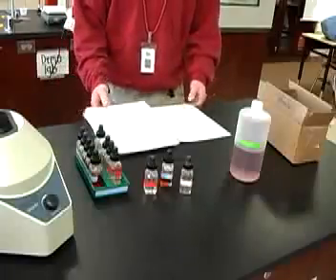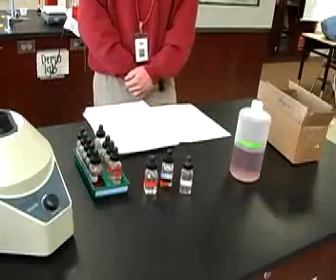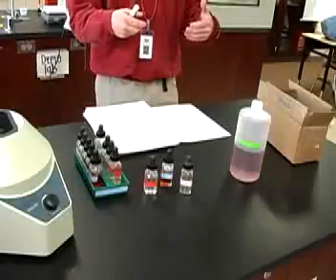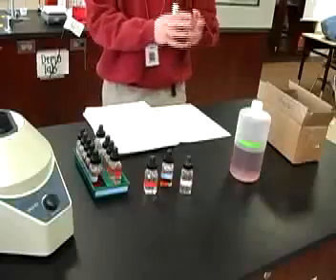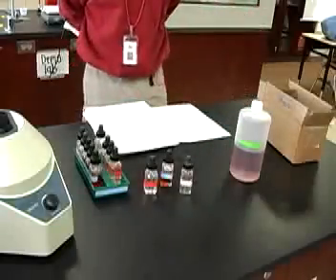A small amount of contaminants present in this volume of water should cause no problem. Replace the distilled water if it appears to need it. So just out of your lab station, grab a distilled water and put your stir rod in there all the time.